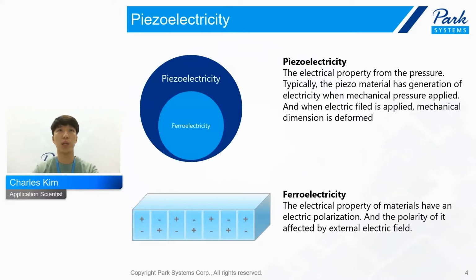So the piezoelectricity. Piezoelectricity means the electrical property arising from external pressure. Typically the piezo material generates electricity when mechanical pressure is applied on the sample. And also in the opposite direction, when you apply an electrical field to the sample, then the piezoelectric material has a physical size or dimension deformation.